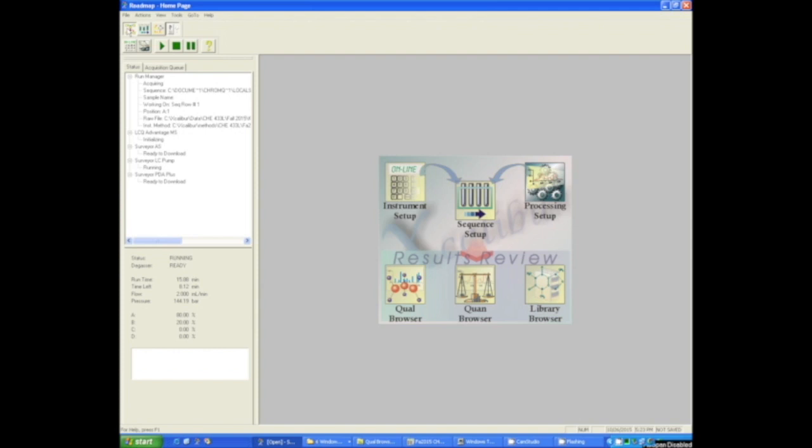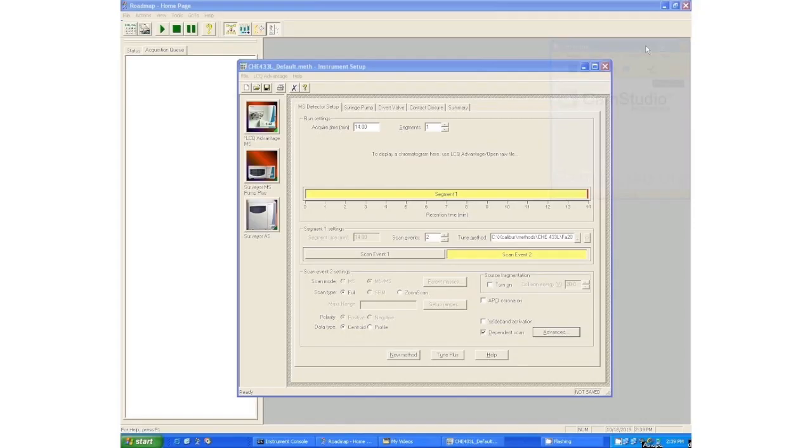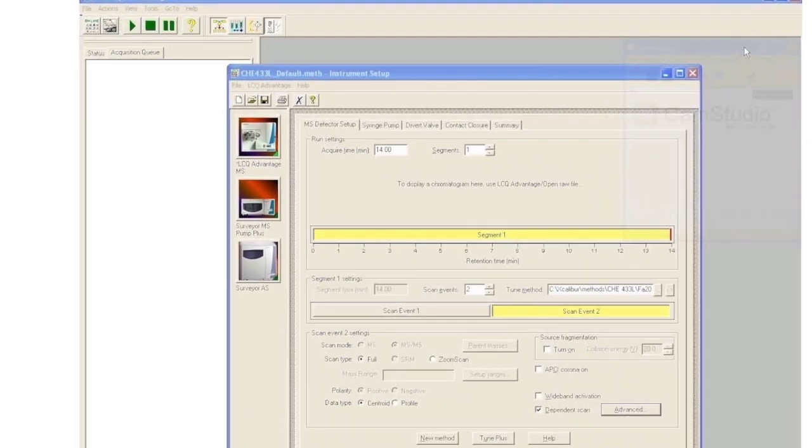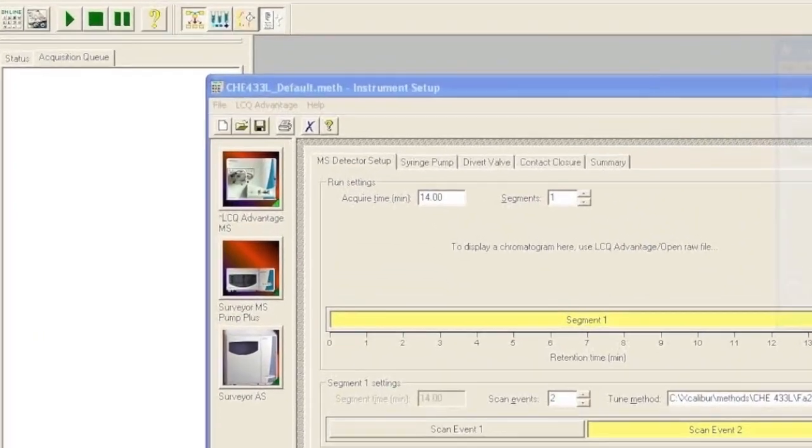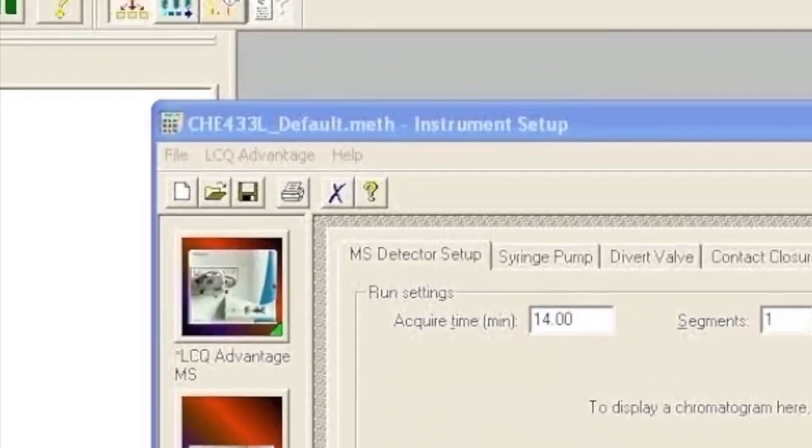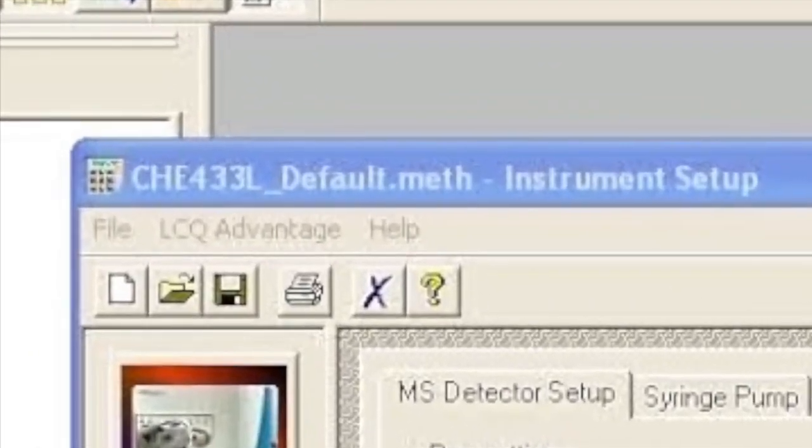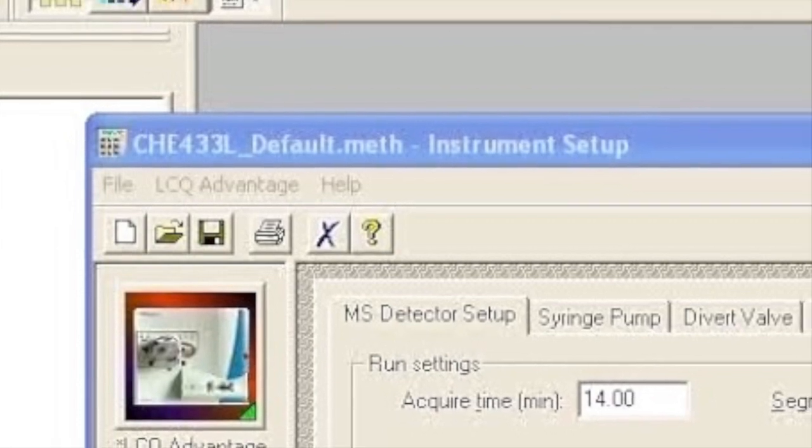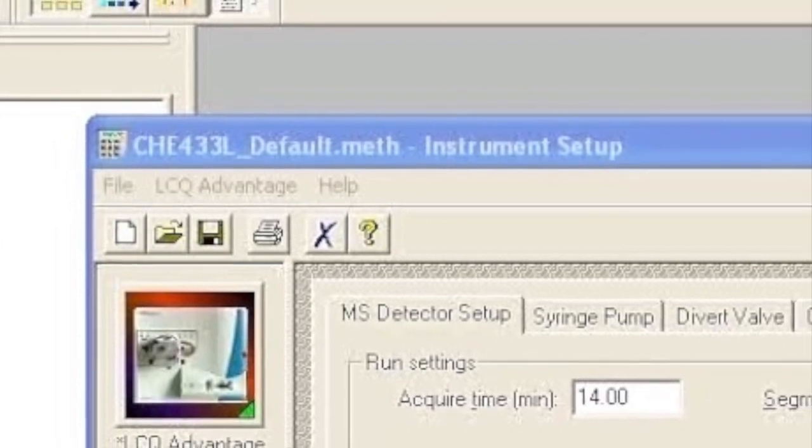So you want to get started making a method from the Roadmap view. Go ahead and click on Instruments Setup. When you do that, it's going to want you to make a whole new method, but you don't want to do that. Just go File and open the default method to get you started. It's right up here.